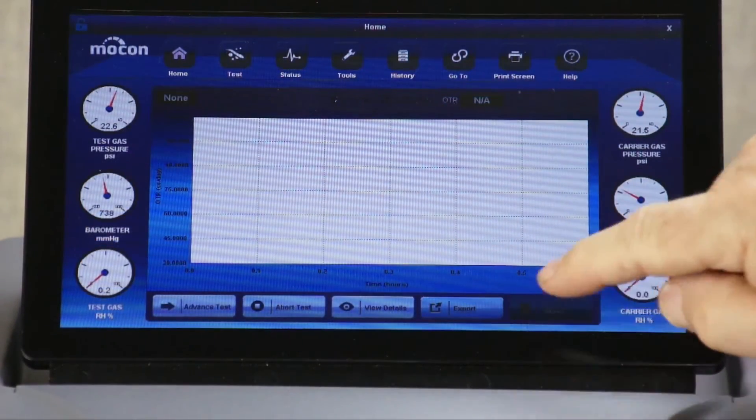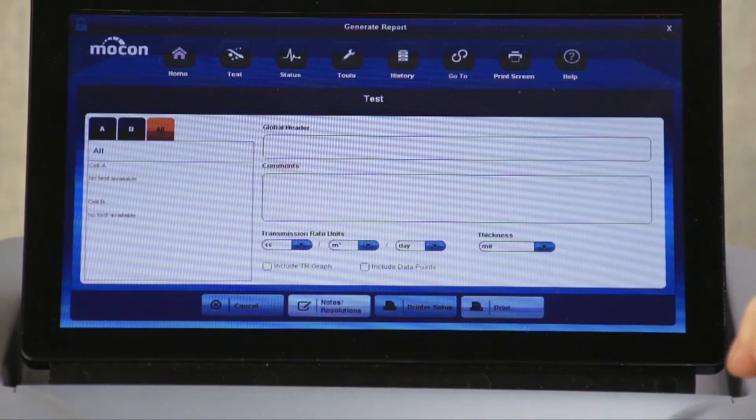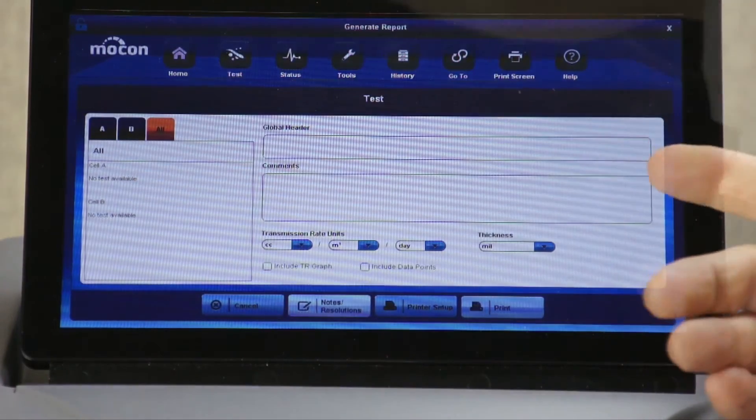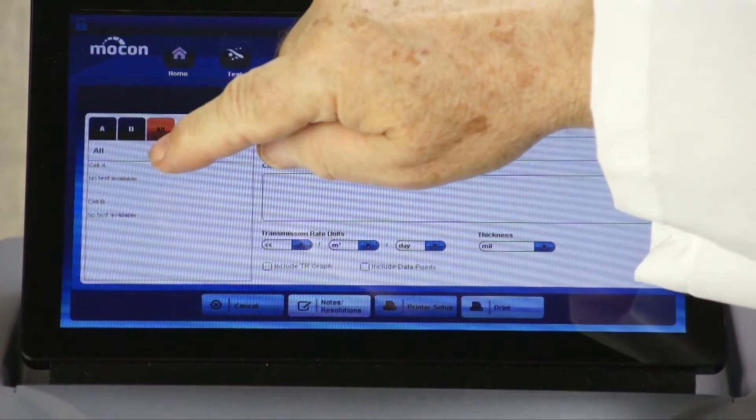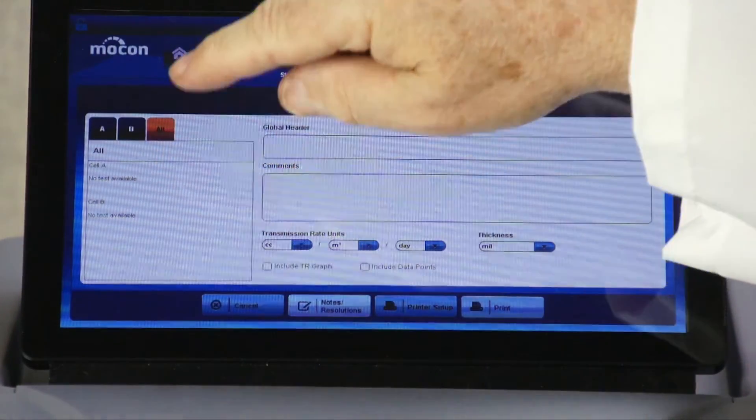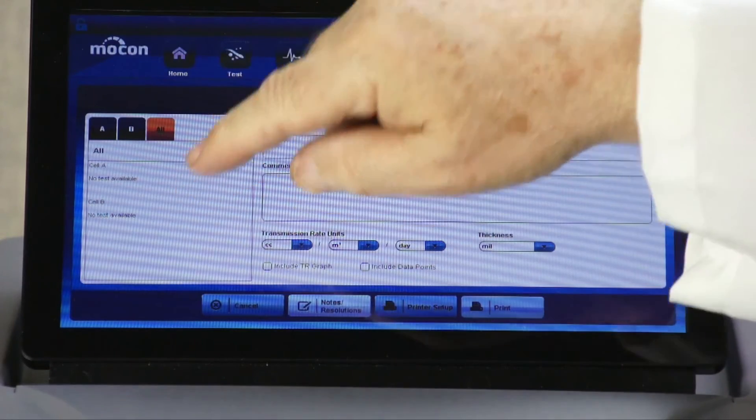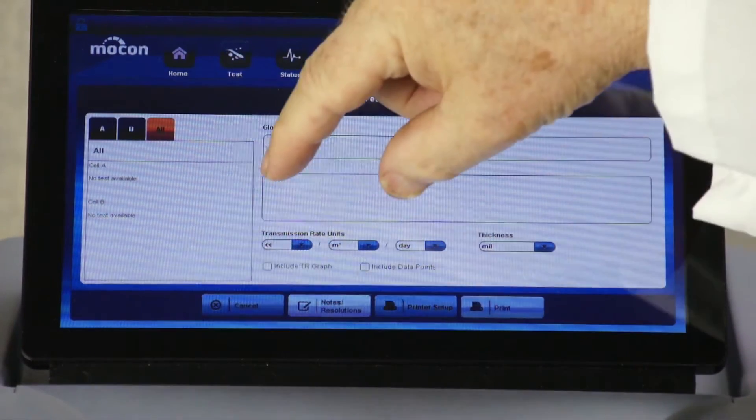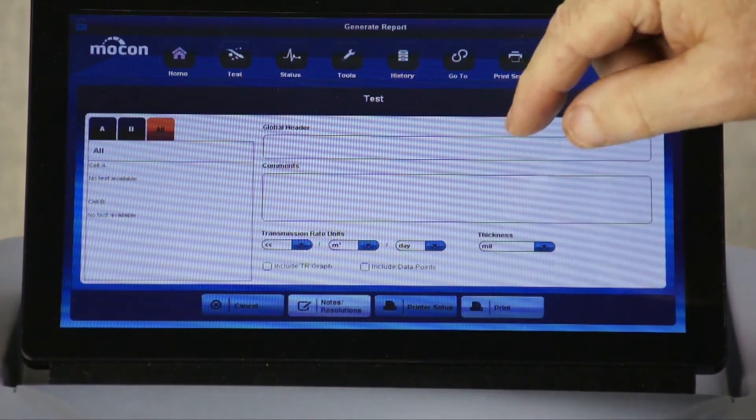By clicking on the reports menu, you'll be able to create a number of reports, including test reports which contain test ID, material ID, OTR rate, and you'll have the ability to add comments.